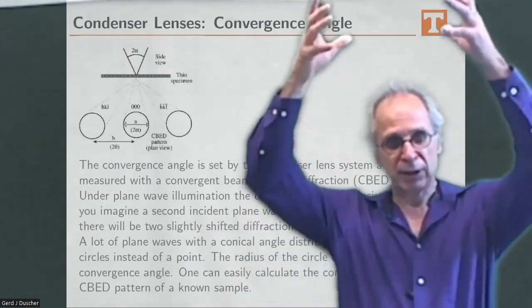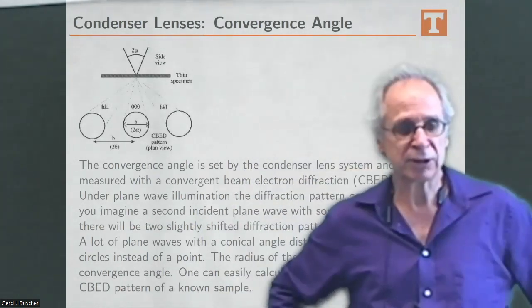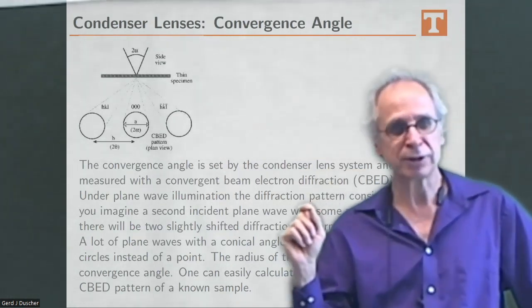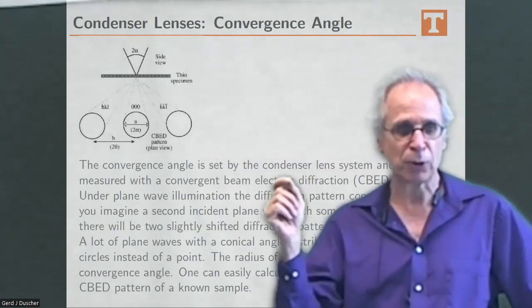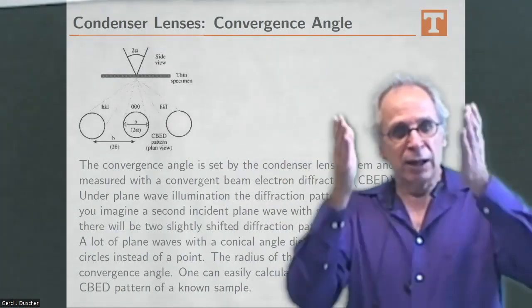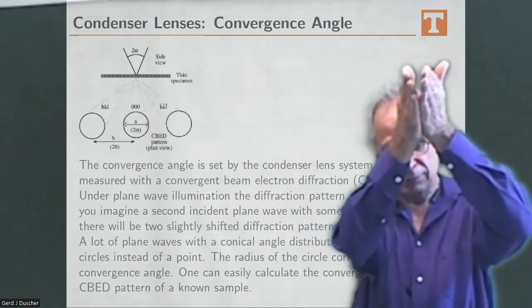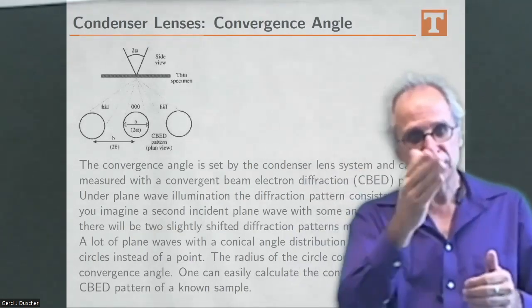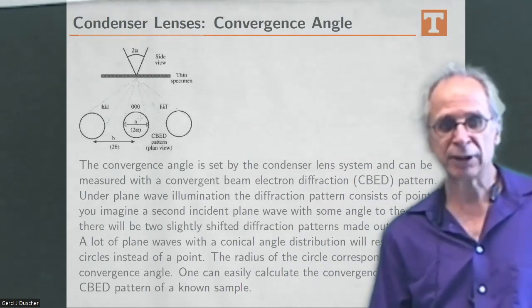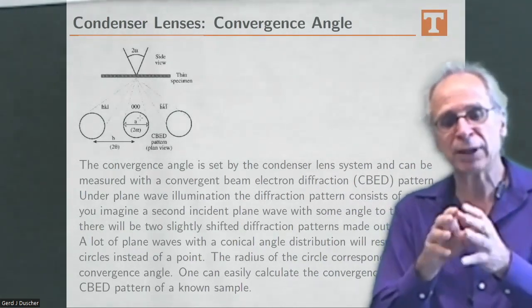If we come in parallel, the electrons are scattered in very distinct Bragg angles, and they would be, in an ideal point world, a spot, with aberrations small disks. If you now increase the incoming angles, then this angle will be shown in your diffraction point, right? So it will slowly grow and become a disk.